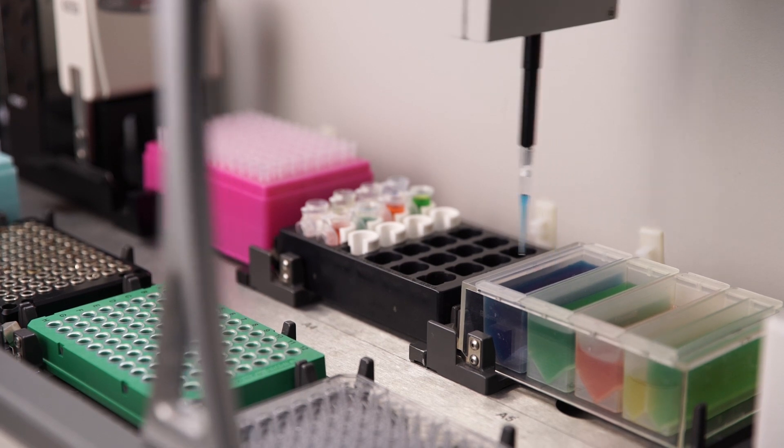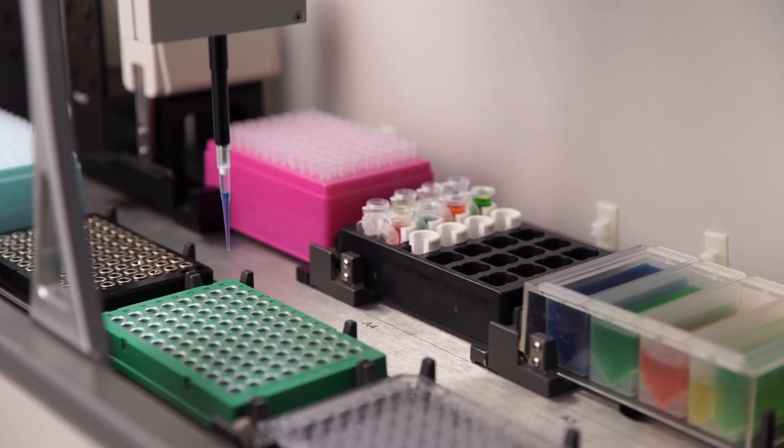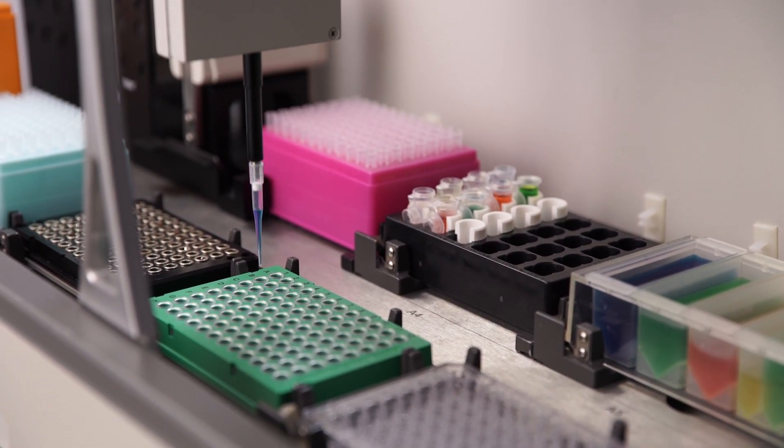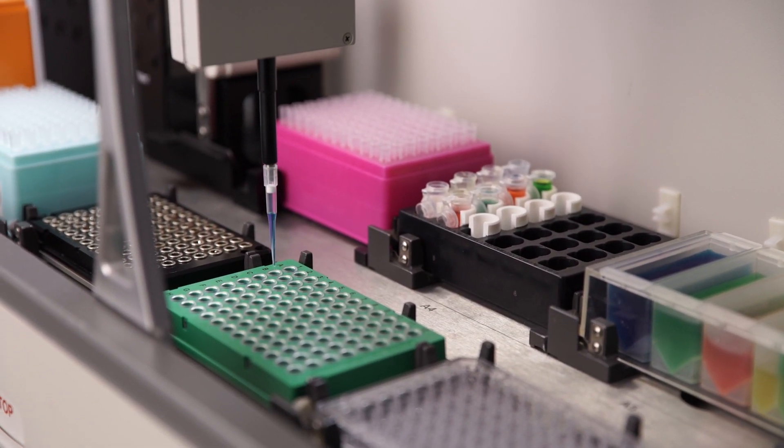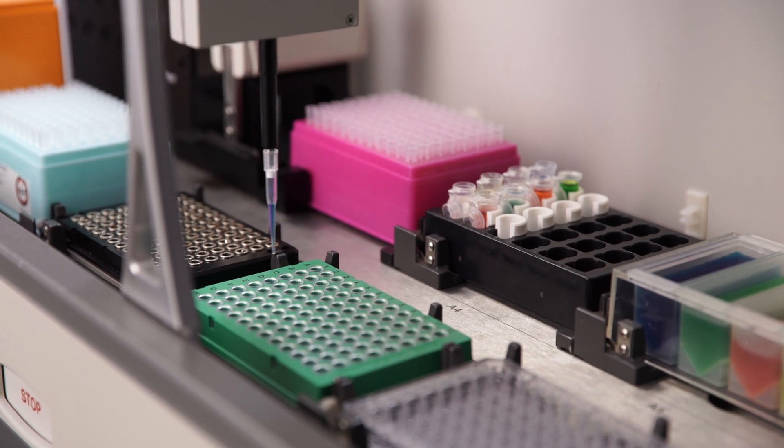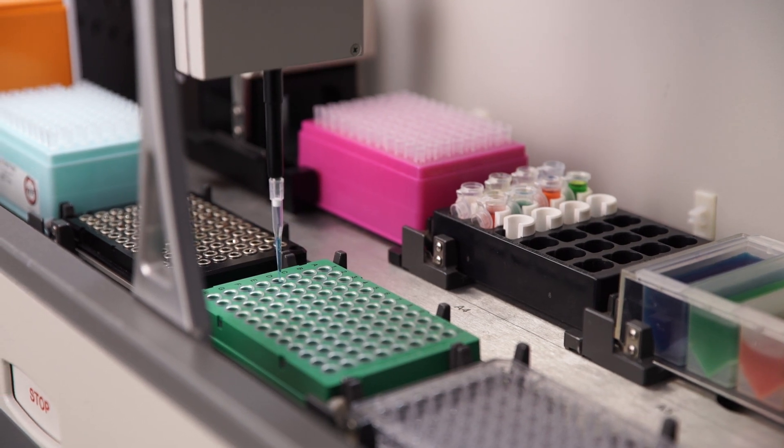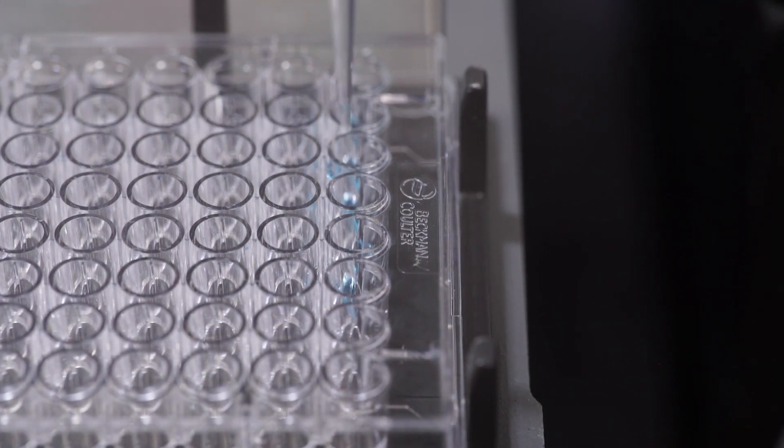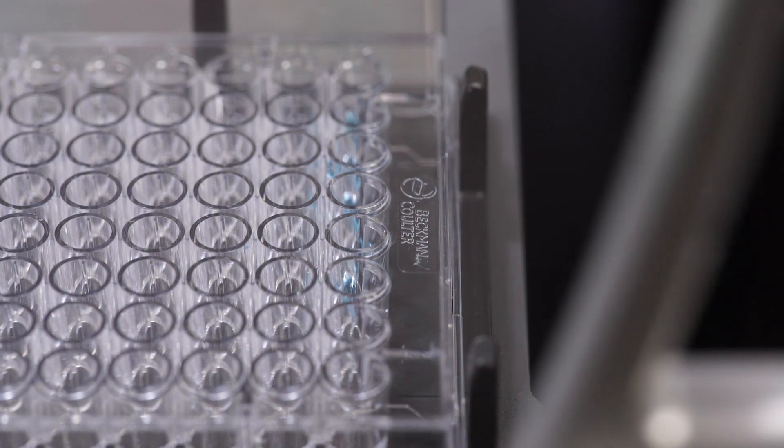The Biomech 4000's advanced hardware and software enables one to optimize every aspect of pipetting, including aspirate and dispense rates, location in well, tip touch, air gaps, and blowouts.